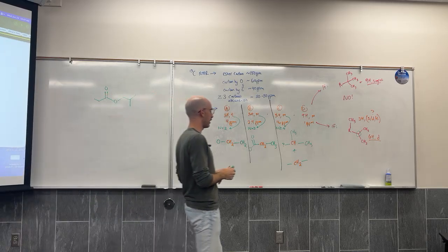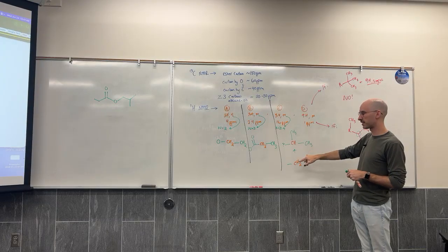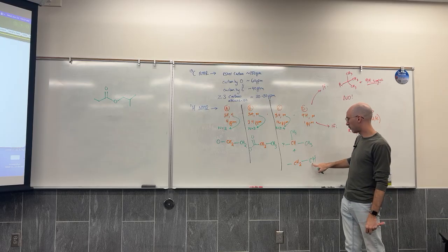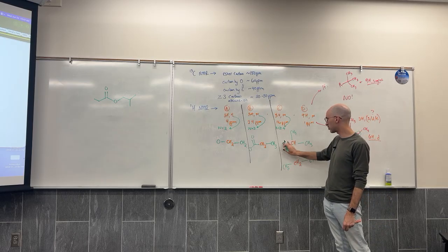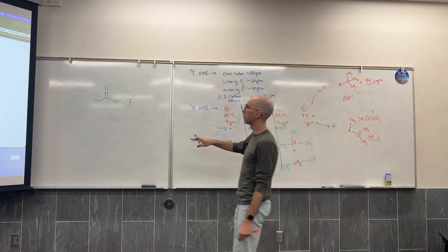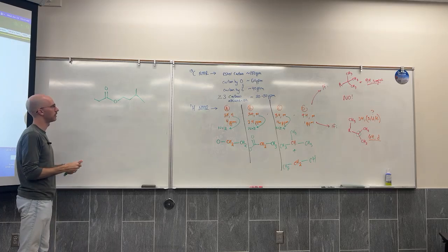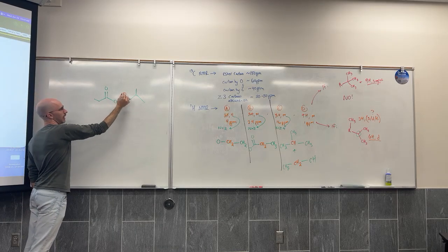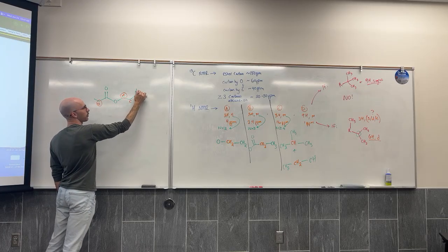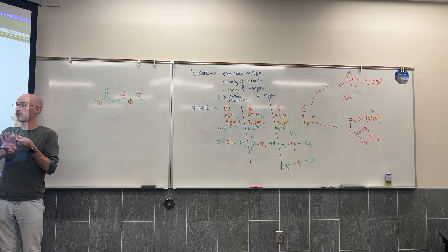And how do you get a triplet? Do you know what? I think it's probably actually a quartet because of how this is going to have to fit together. To get a quartet, I need 1H on one side and a CH2 on the other, which means that here I've got a CH2. So my structure was missing this CH2. Here was my signal A. Here was my signal B. These were both showing up as what I had labeled as C because they overlapped with each other.